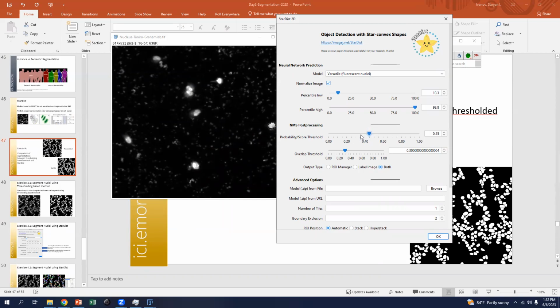Now, what are the numbers you should set these to? Again, it depends on your data. When I'm using this, typically I will use it several times on the same image to see if I'm going in the right direction or the wrong direction. So it does take a bit of fiddling and playing around. The more you use it, the more you'll come to understand what ranges tend to work for what kind of data sets.